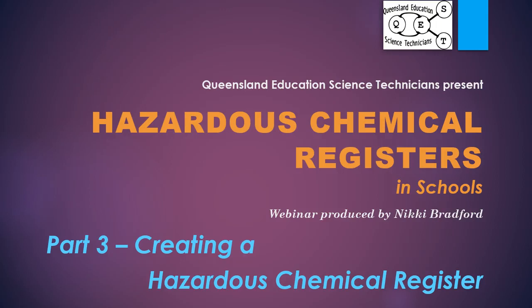Welcome to Part 3 of the Queensland Education Science Technician webinar on hazardous chemical registers in schools. In this presentation I will walk you through creating a hazardous chemical register using Microsoft Excel 2013.